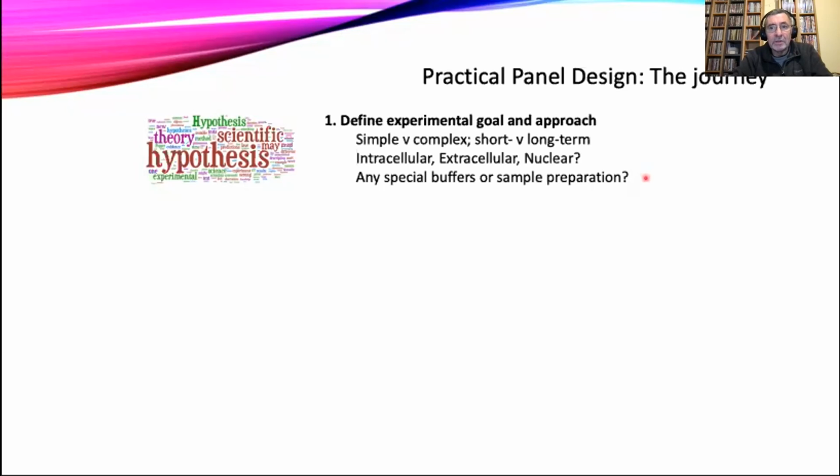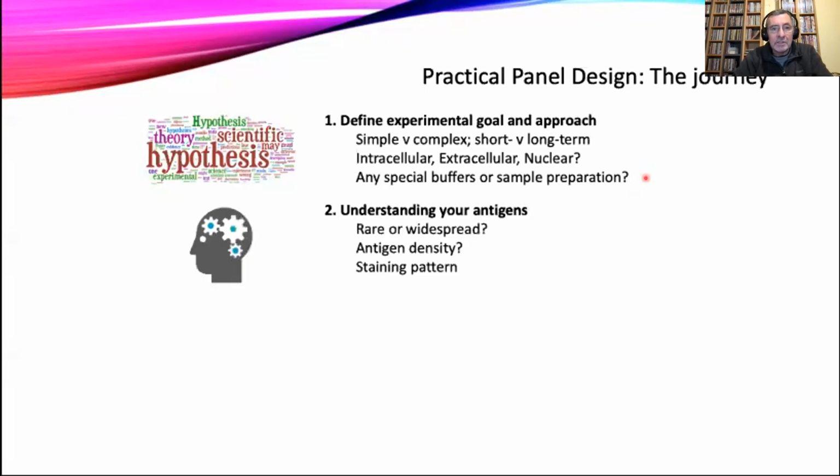And that might mean that we're going to need some special treatment. Generally, antibodies aren't going to go into whole cells without the fixation or permeabilization steps that we're going to need to put into there. So all of that is going to be thinking about our experimental design.